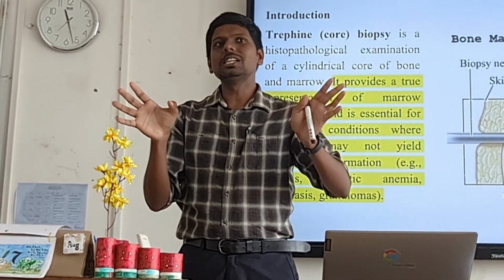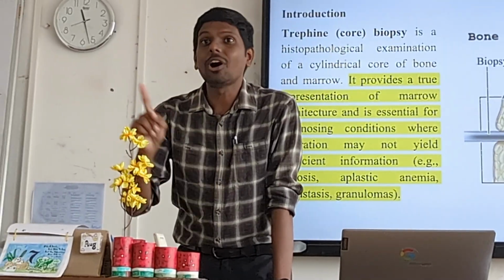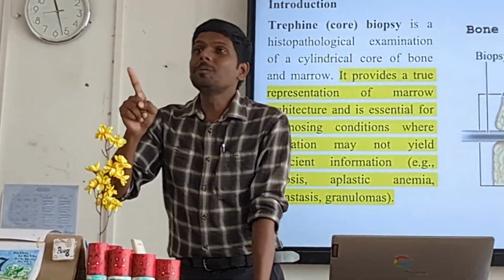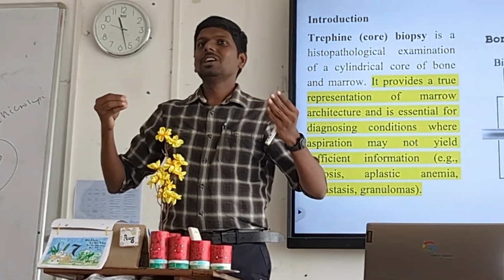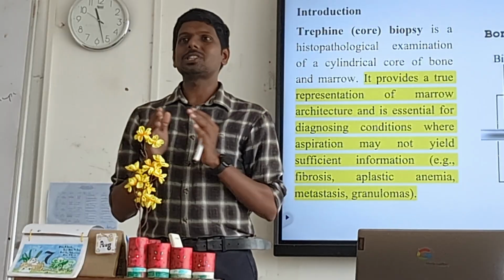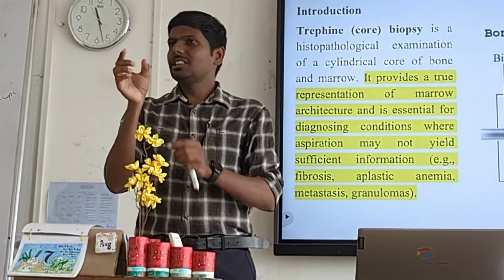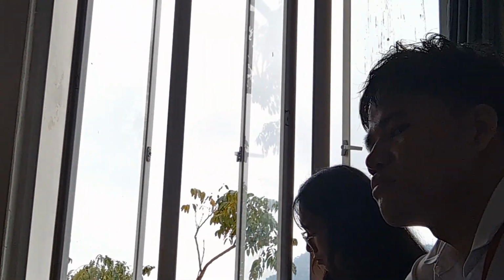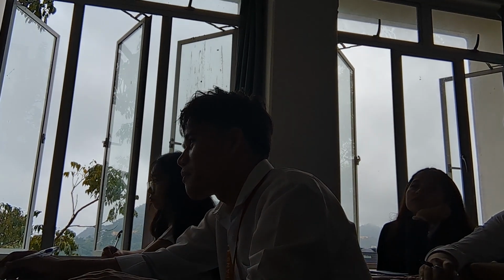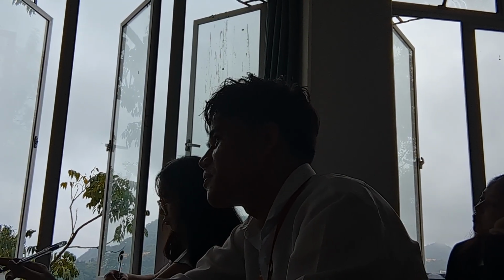The simple rule is the baddest culprit is water. Actually, not even microbes. Microbes need water for their survival. If we remove water from the tissue, microbes cannot decompose the tissue because they need water for their growth. So the idea is, what are the ways to remove water from the tissue? One technique: take a dead body, remove the visceral organs, stuff it with salt.